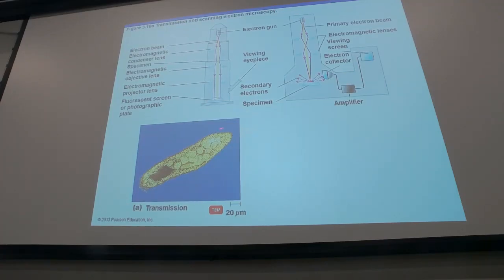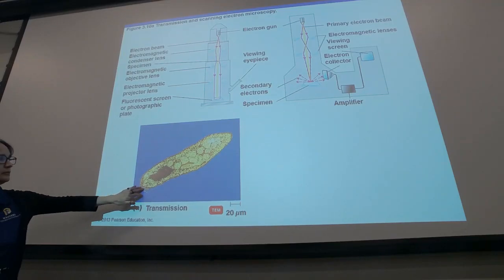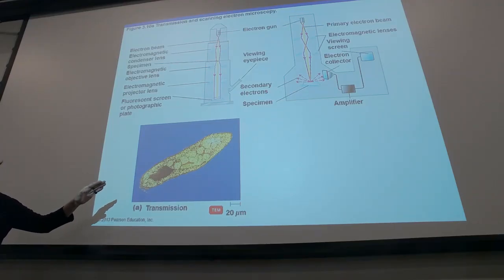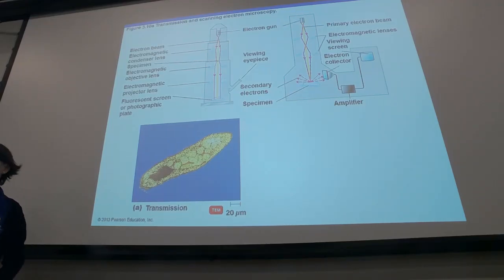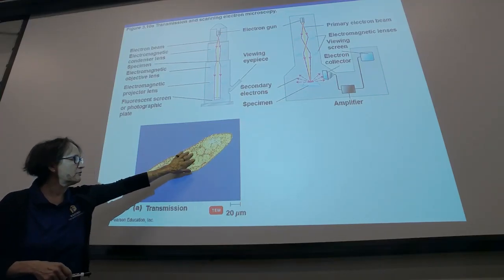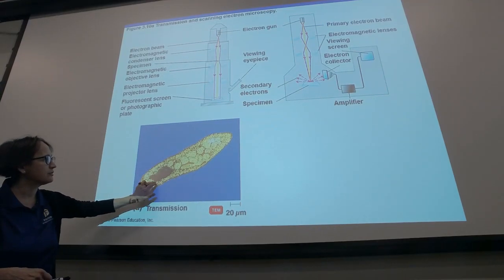So look at this paramecium with these microscopes, which are electron microscopes. They have an electron gun, an electron collector, an amplifier, and then they send this image into our software so that you can have this type of view. This was very likely coated with gold, and if not, gold salts. And I know it's very expensive nowadays, the ounce. It's 10 times more expensive than what it used to be 40 years ago. Anyway, you can see better resolution of the internal structures, and here's the nucleus.